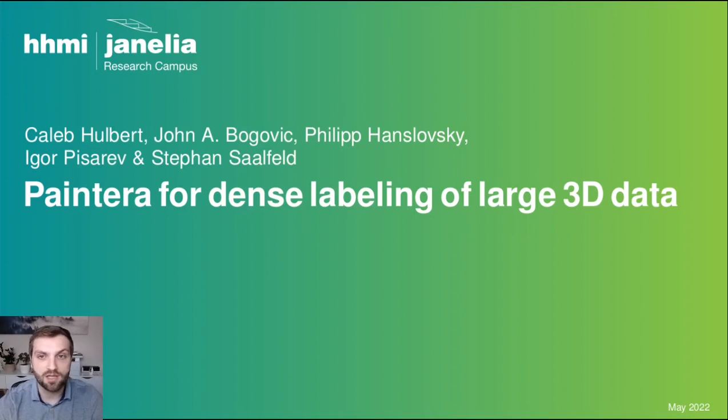Today I'm going to be talking about Paintera, an annotation tool that we developed to improve upon the state of dense annotations of large 3D volumetric data. I'll be giving a brief overview of Paintera and then showcasing existing projects that are using it. Then I'll demonstrate a few of Paintera's unique features, including some exciting annotation tools. At the end, I'll mention some of the proposed additions and improvements we would like to see moving forward.